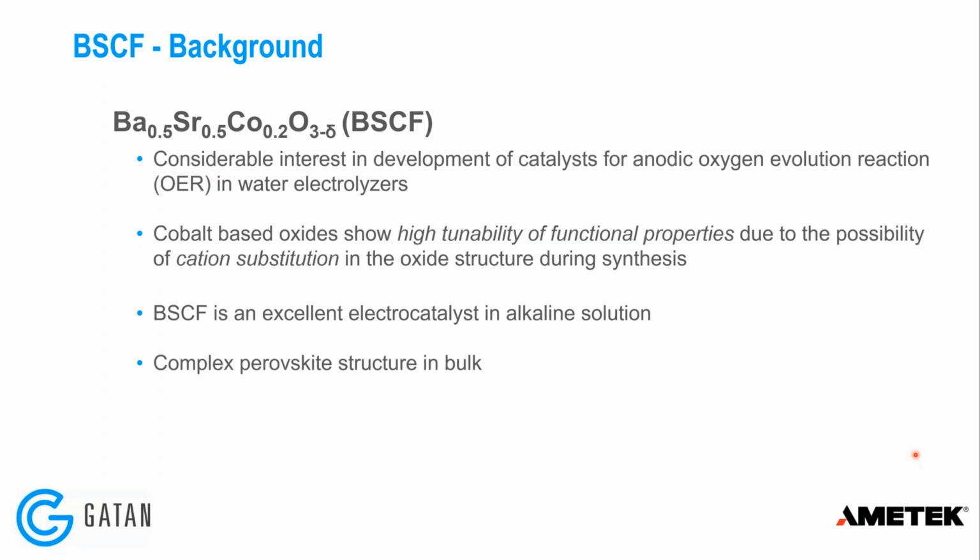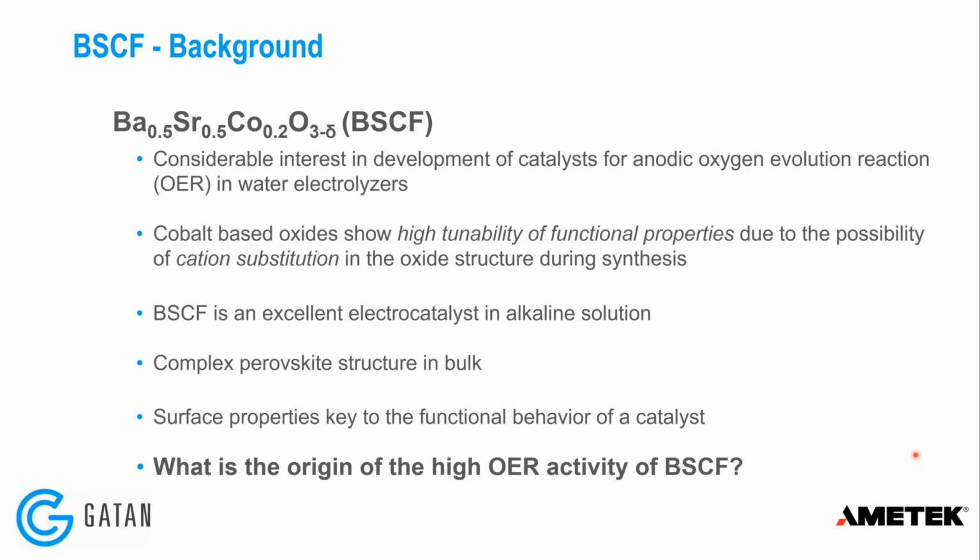It has a complex perovskite structure in bulk, but when we're talking about catalysis, we're really interested in the surface properties as they're key to the functional behavior of a catalyst. So what we're interested in is the origin of the high OER activity of BSCF.